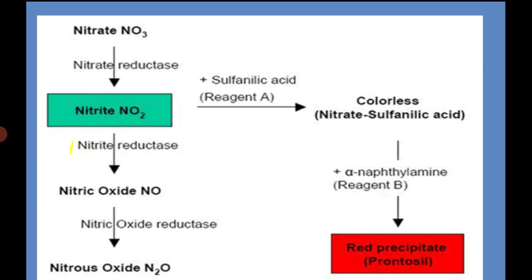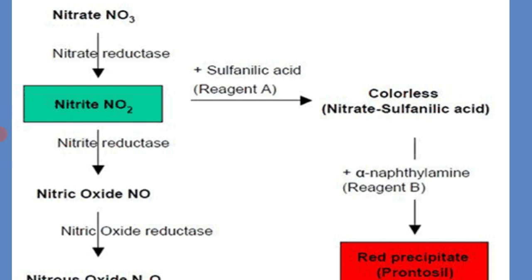The reaction for this test: the nitrate present in the medium in the form of KNO3, by the action of the enzyme nitrate reductase, gets converted into nitrite, that is NO2. If there is formation of nitrite in the medium, it can be detected by using two reagents, sulfanilic acid and alpha naphthylamine.